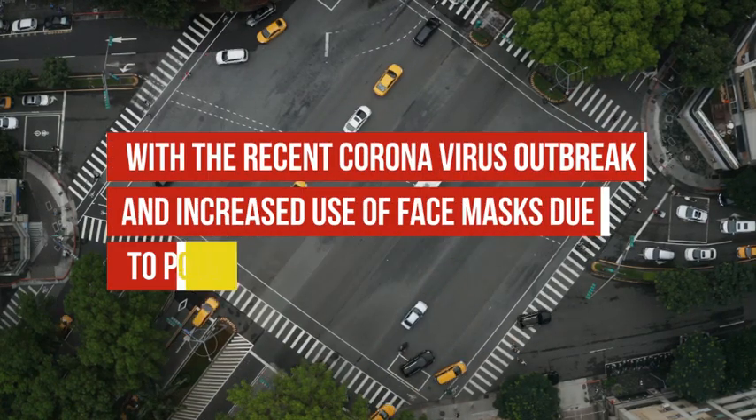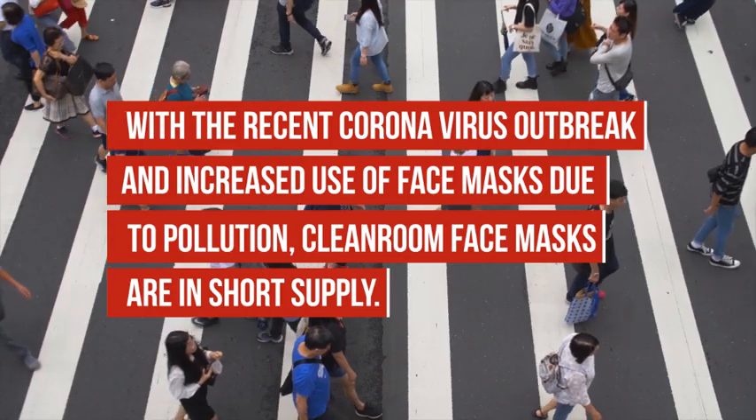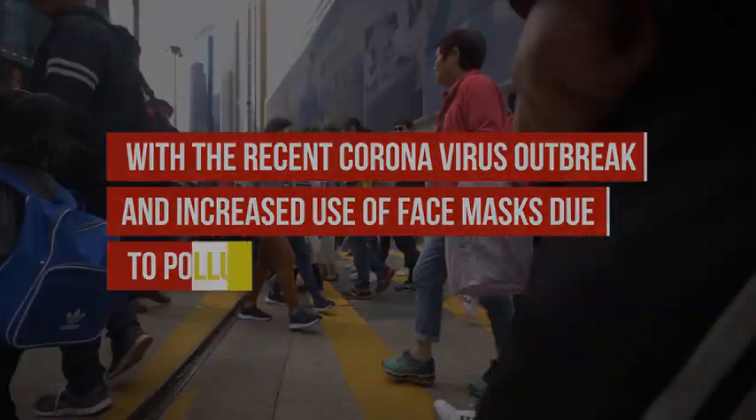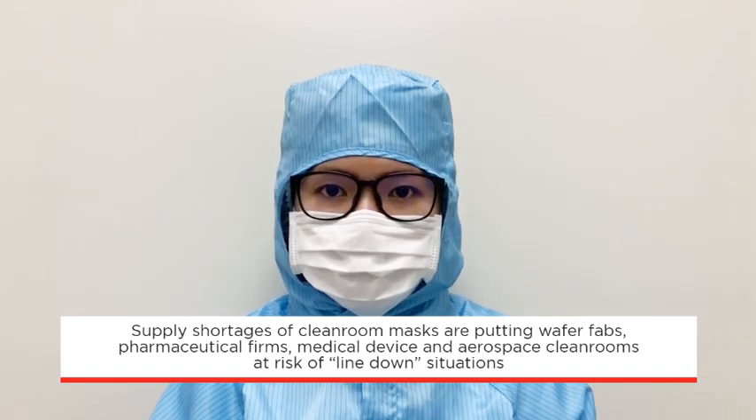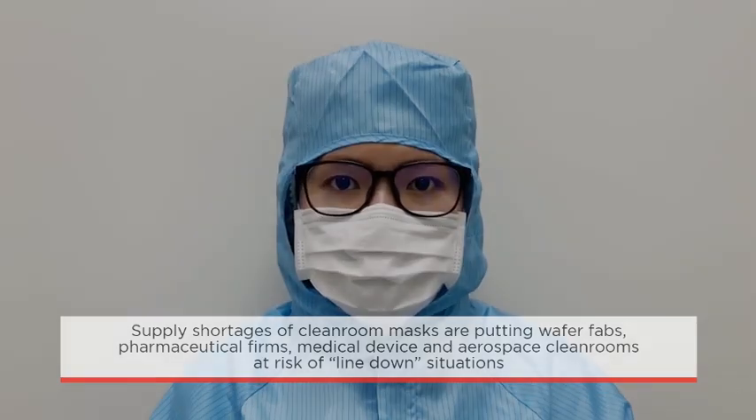With the recent coronavirus outbreak and increased use of face masks due to pollution, cleanroom face masks are in short supply. These supply shortages are putting wafer fabs, pharmaceutical firms, medical device and aerospace cleanrooms at risk of line-down situations.